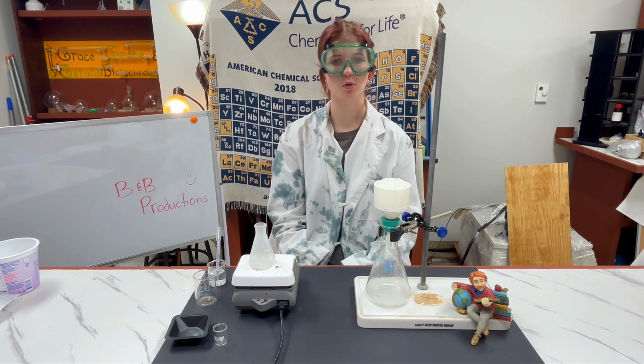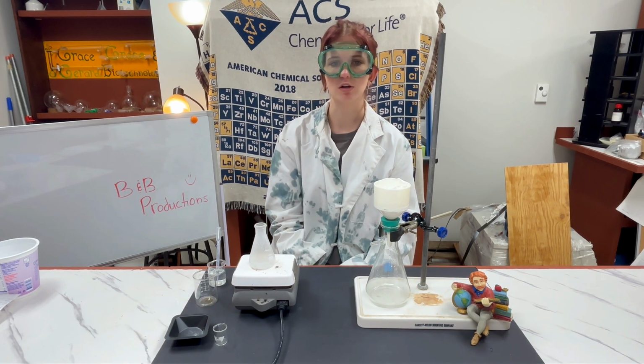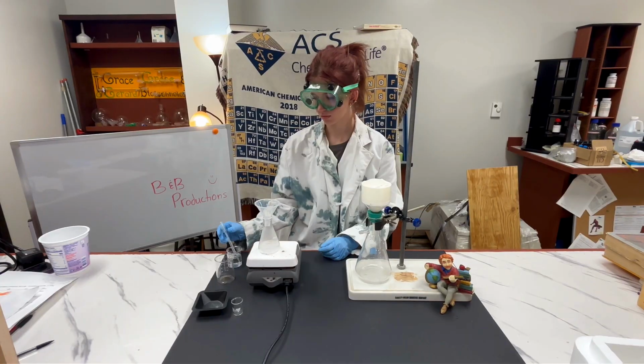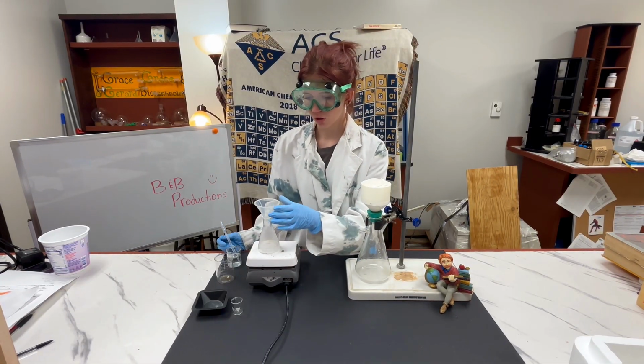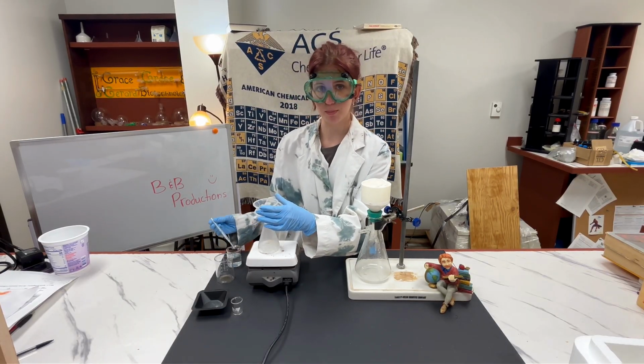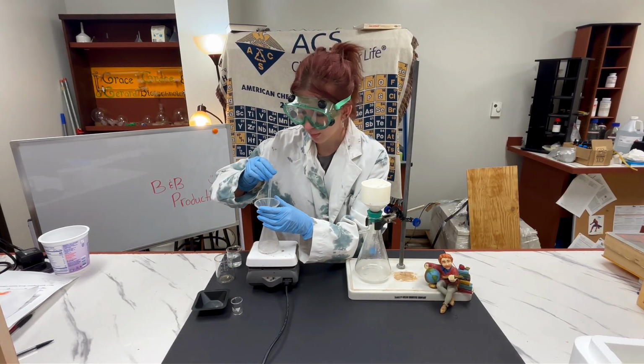While the solution is boiling, we'll add about 1 milliliter of water at a time until the benzoic acid fully dissolves. So there's a little bit of residue left in the funnel, so I'm going to be using a pipette and water just to make sure we get all of that product out of there.